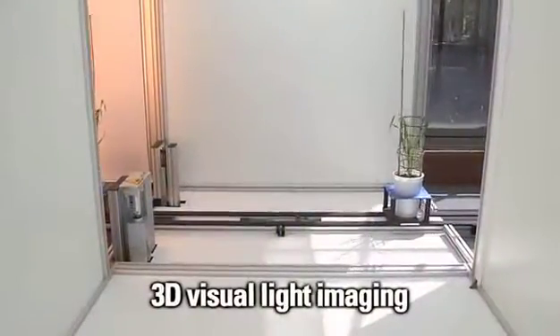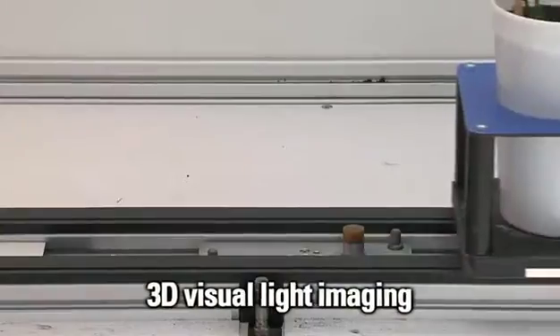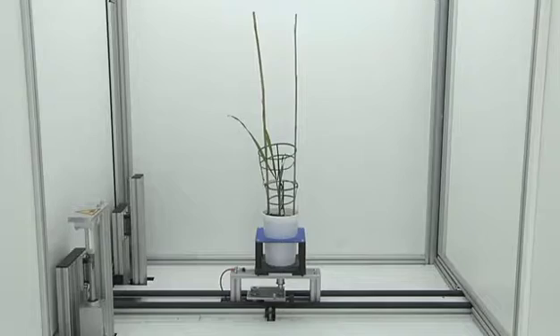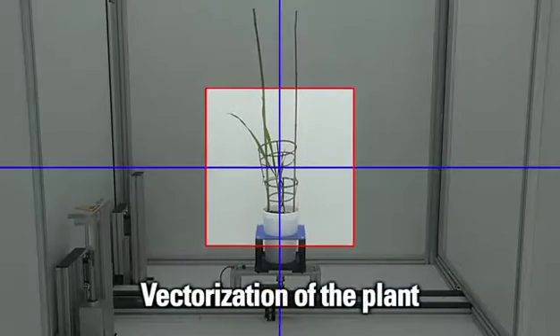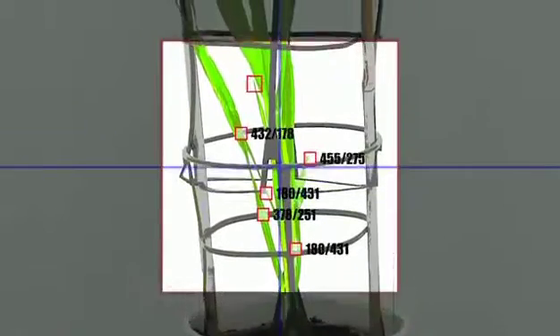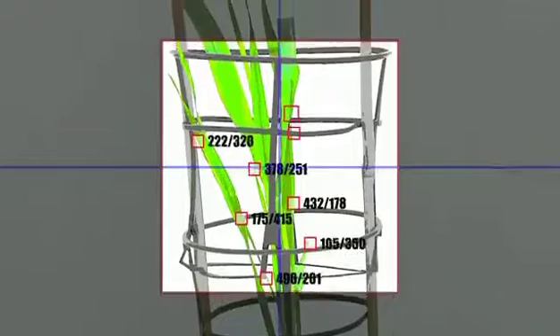Based on multiple wavelength imaging, plants are imaged under highly defined conditions in specific chambers. Plant-specific imaging protocols lift the plants and define camera magnification in order to achieve optimized imaging of all growth stages.